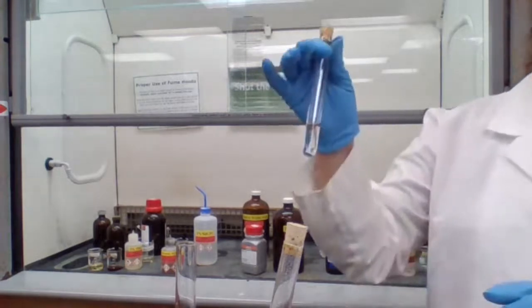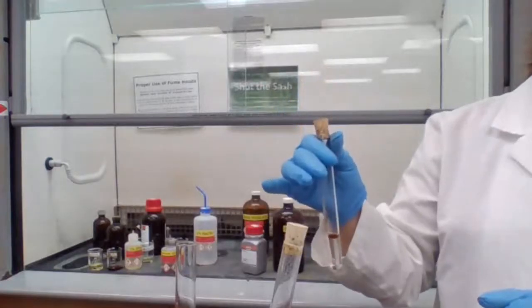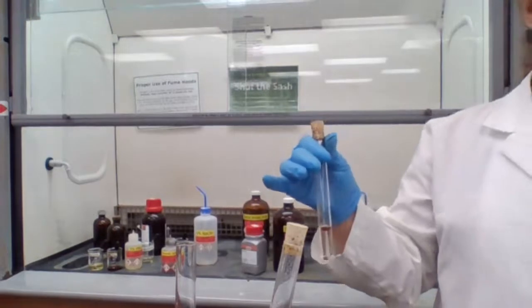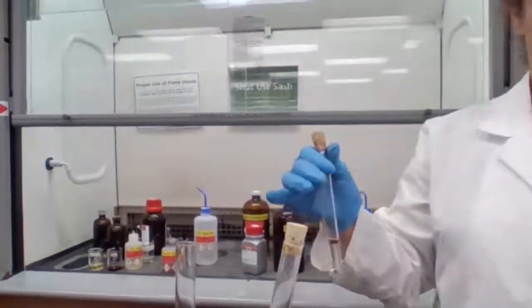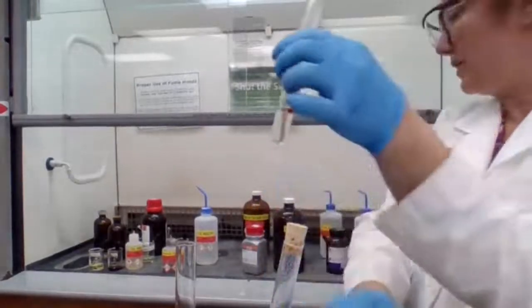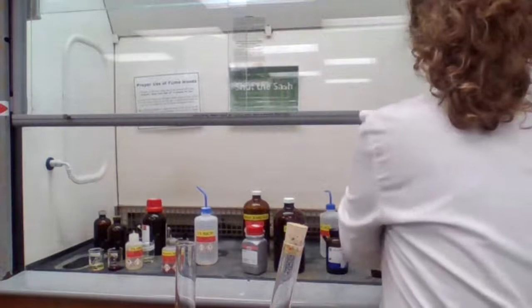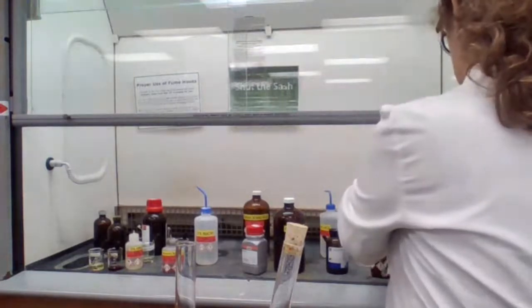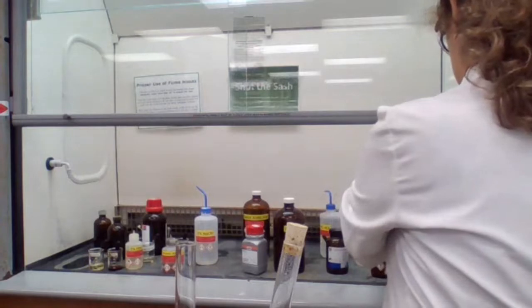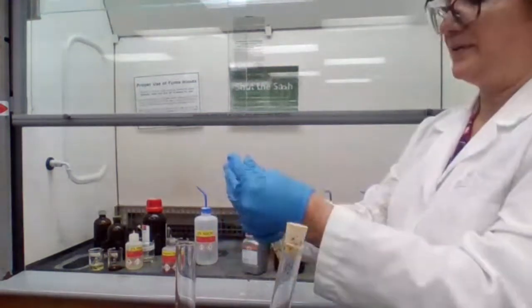Going to stopper it and shake it. What are we looking for with the secondary? What do you think will happen with the secondary?